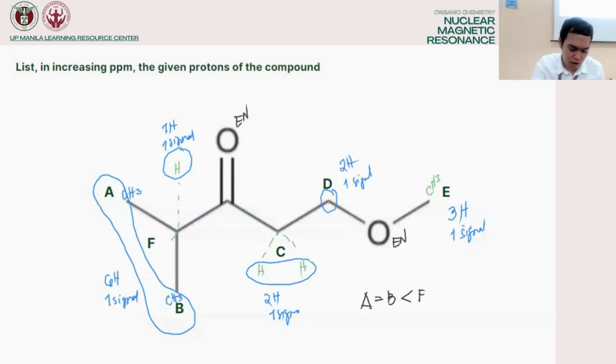Ito kasi ito yung carbon mo, no? Ito malayong malayo kasi dalawang carbon before O, right? Carbon 1, carbon 2, carbon 3. Ay, carbon 3, tas O. But in the case of this hydrogen, no? Hydrogen, carbon, tapos ito yung carbon niya, tas ito na ulit, ito na yung carbon niya. So dalawa lang before your oxygen, no? That's why letter F ito. Oh, what's next?